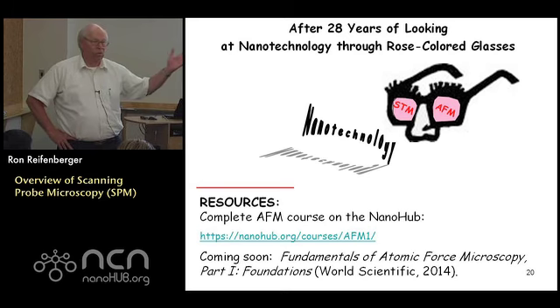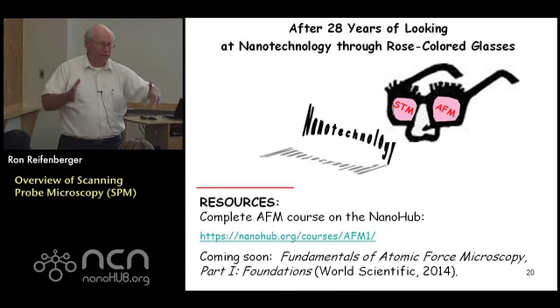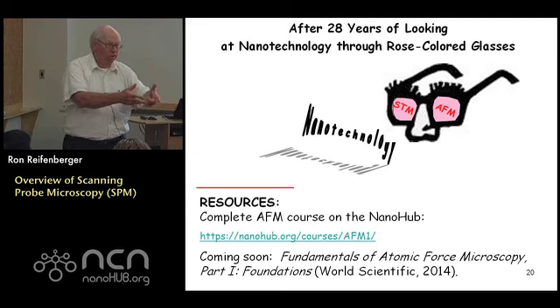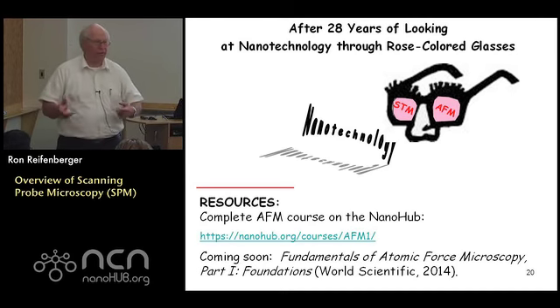But I'm told that on fab lines in the semiconductor industry, they need to have like 3 SEMs, and they're constantly checking the calibration of one with respect to the other, because, you know, they need to know the separation between 2 lines very accurately to make their chips work. And if they put it into one SEM, they get one answer. They put it into another, they get another answer, right? Because the calibrations are very critical, right?